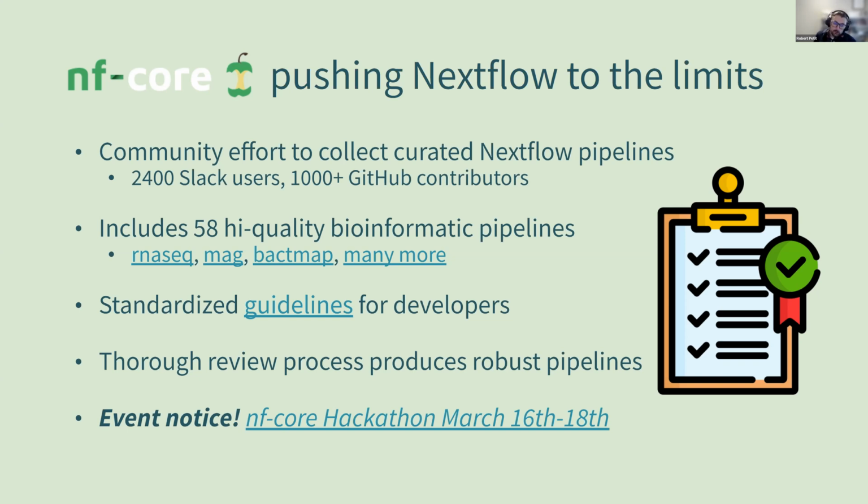They have numerous standardized guidelines for developers, and while you don't have to take what they give and expect to put it on NF Core, a lot of their guidelines are just good practices for Nextflow, and good practices for software development in general as well. If you do go the route of trying to get a workflow on NF Core, they have a very thorough review process, which allows them to produce pretty robust pipelines.